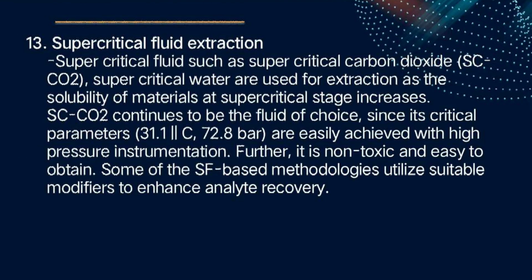Supercritical fluid extraction. Supercritical fluids such as supercritical carbon dioxide and supercritical water are used for extraction, as the solubility of materials at the supercritical stage increases. Supercritical carbon dioxide continues to be the fluid of choice since its critical parameters, 31.1 °C and 72.8 bar, are easily achieved with high pressure instrumentation. Further, it is non-toxic and easy to obtain.